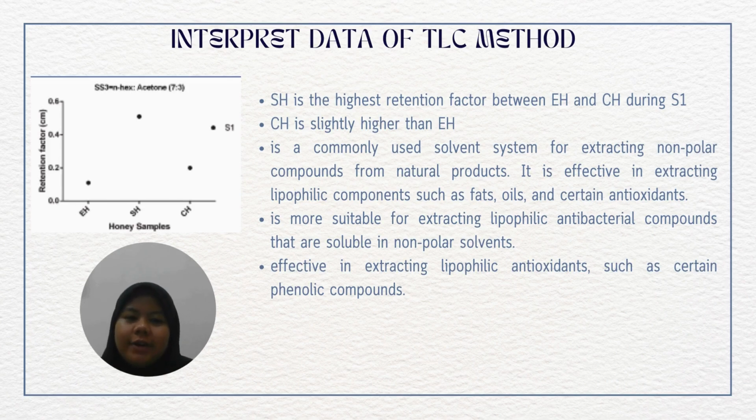It is efficient in extracting lipophilic compounds such as fat, oil, and antioxidants. It is more suitable for extracting lipophilic antioxidant compounds that are soluble in non-polar solvent, such as carotene and certain phenolic compounds.